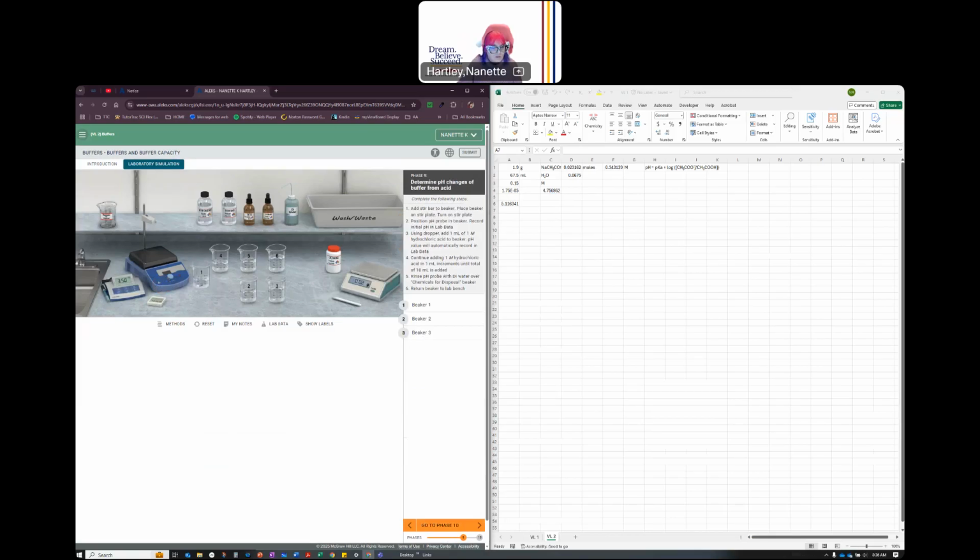Stir there. No, something updated to 5.3.